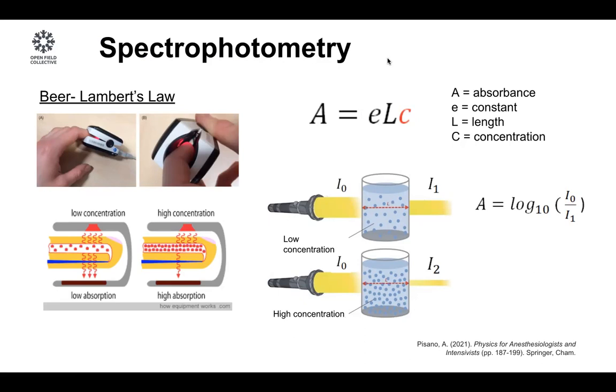The idea is to minimize the differences between these two light points that we are measuring, the input light and the output light, and normalize it on the maximum scale. So basically the idea is just to measure these two light points, and the log is just to transform the data. I just wanted to say that.